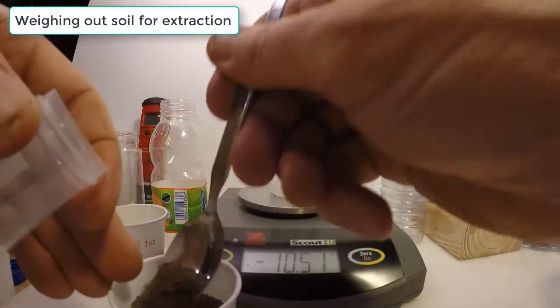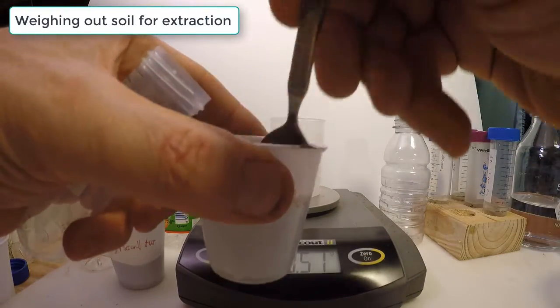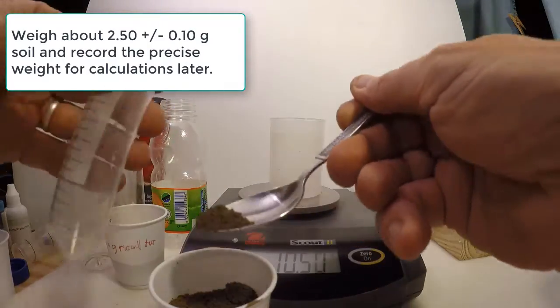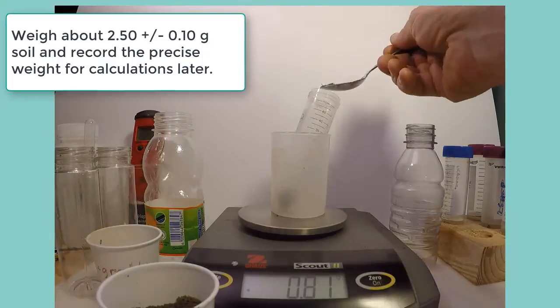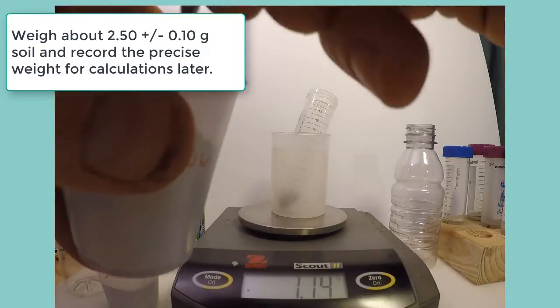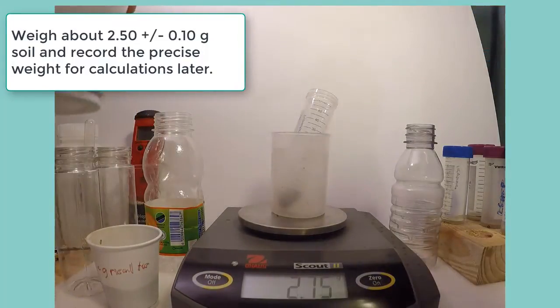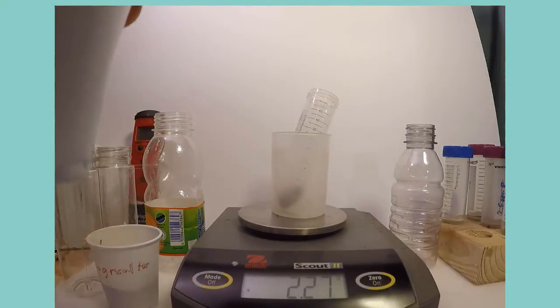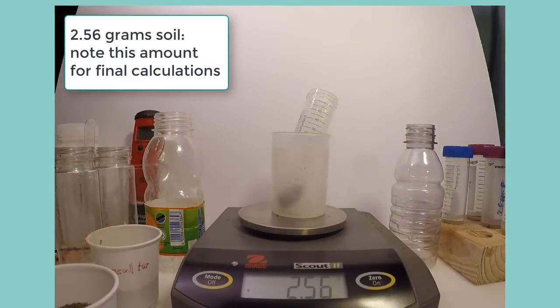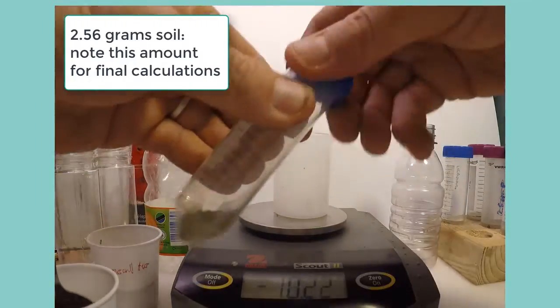The first step in the procedure is to weigh out two and a half grams of soil, which can be either field moist or more usually air dried soil. Here I'm going to weigh out two samples to show two different filtering methods later on. The precise weight of soil should be noted for use in calculations — in this case, 2.56 grams.